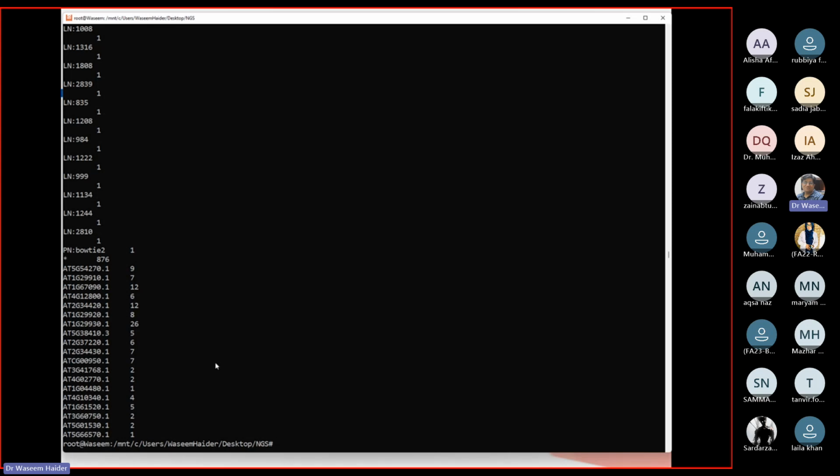So now our file becomes numeric, it goes into numbers, and now we can simply process this in Excel or R or someone else, and then we can do the rest of the analysis. We will do the rest of the calculations in Excel and R, because now our data is becoming numeric data, so we get our file in numbers. We love to play with numbers, by the way, right?